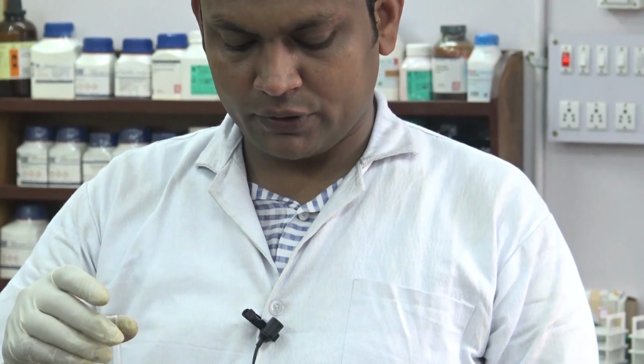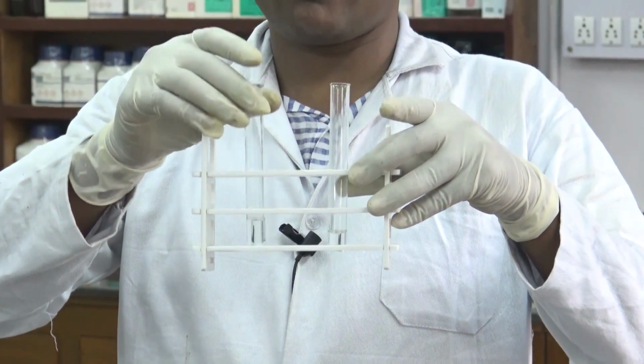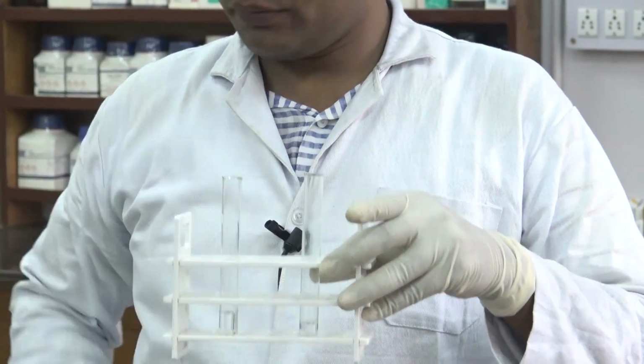Here I am putting the sample solution on my left hand, and on my right hand I am putting the blank test tube, or test tube filled with the distilled water.